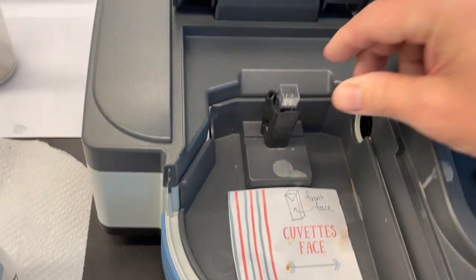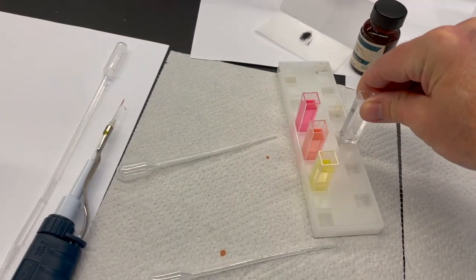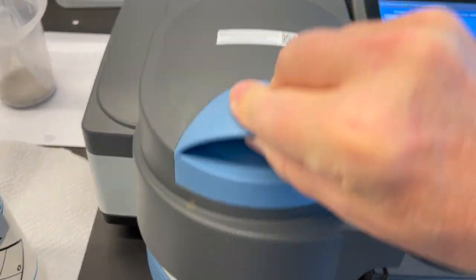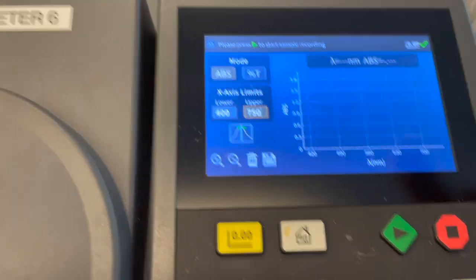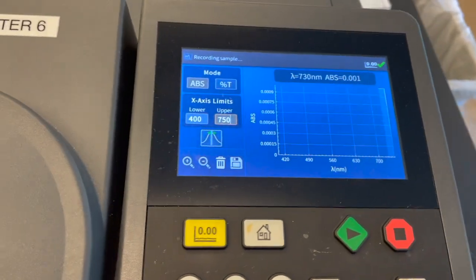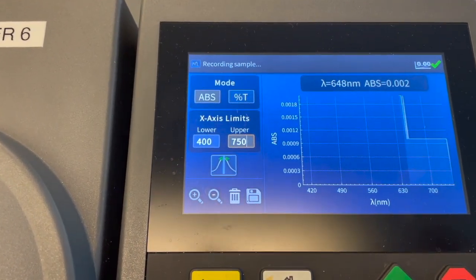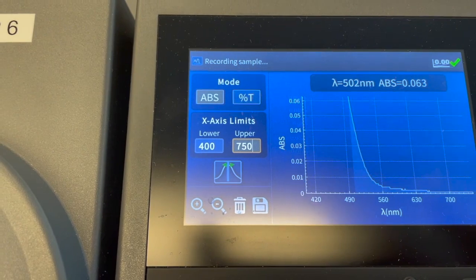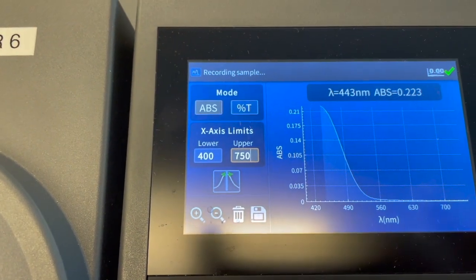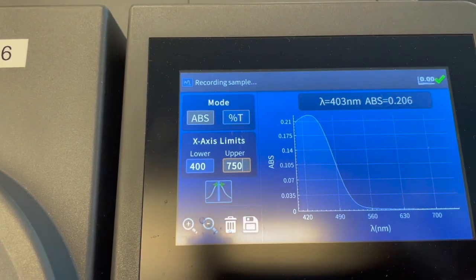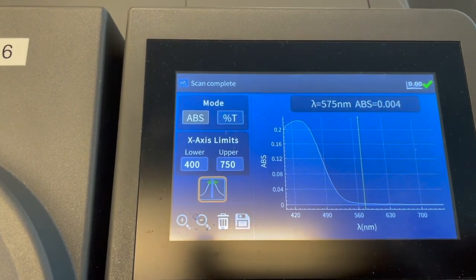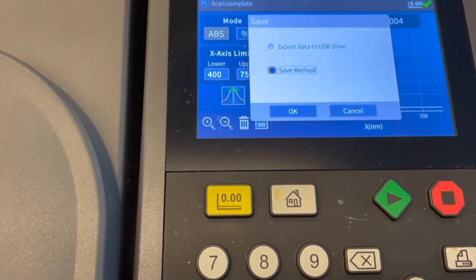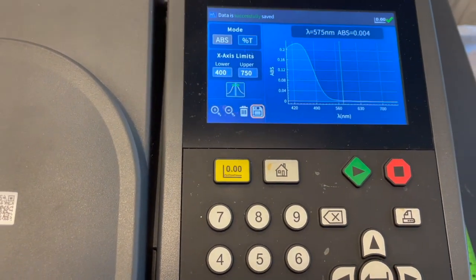I'm going to take the water sample out and put the base sample in. Then according to the directions, I push the play symbol. It's scanning starting at 700, and this time we actually see the spectrum. It's auto-scaling, which is why it's kind of going crazy there. And there's the spectrum of the base form. I don't want to lose this — save to B drive. And it's saved.